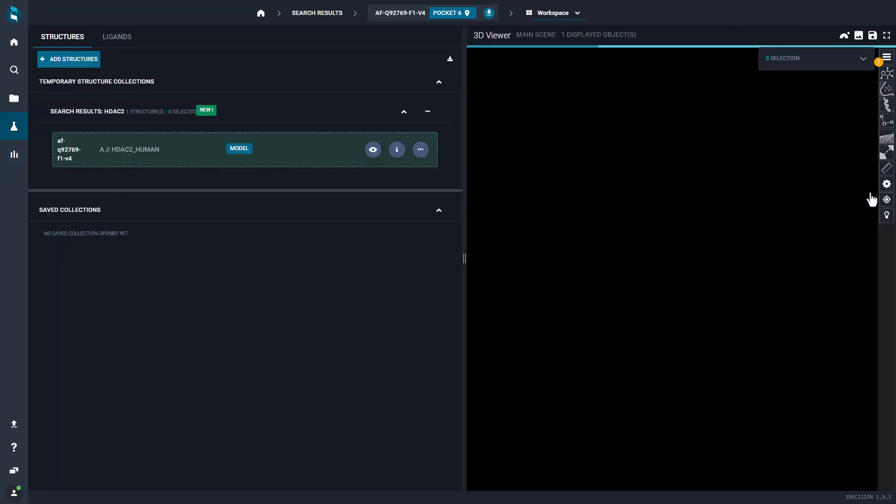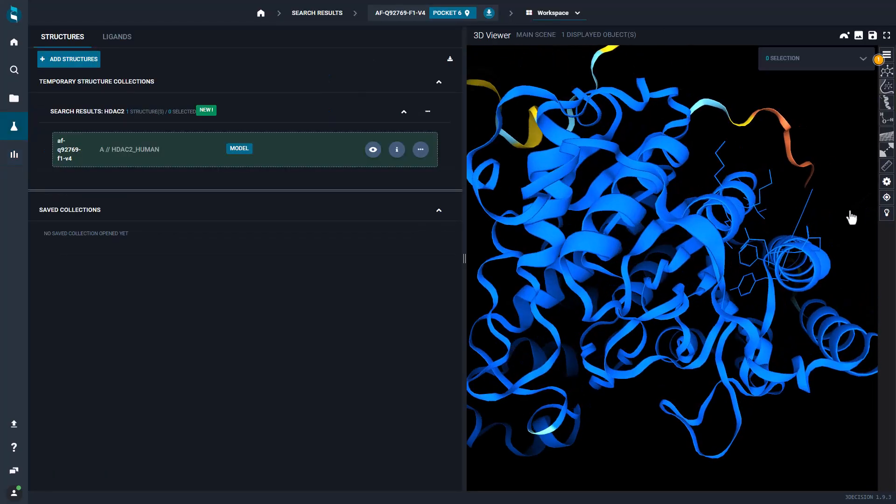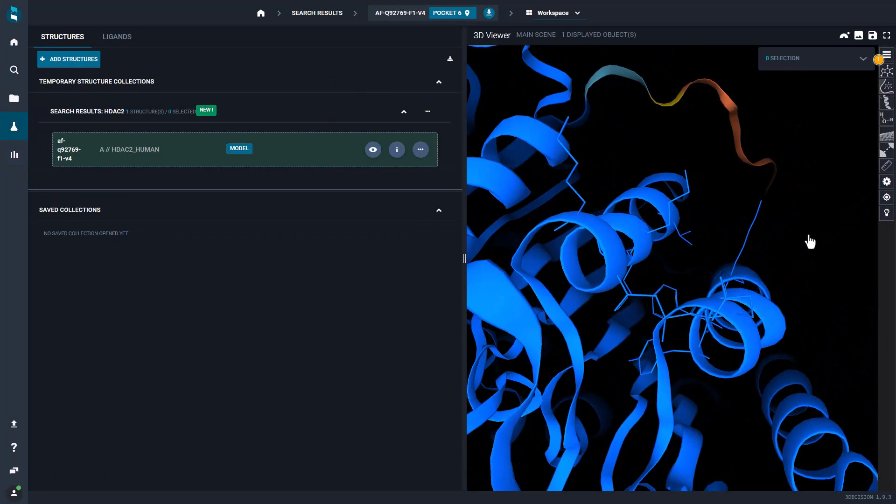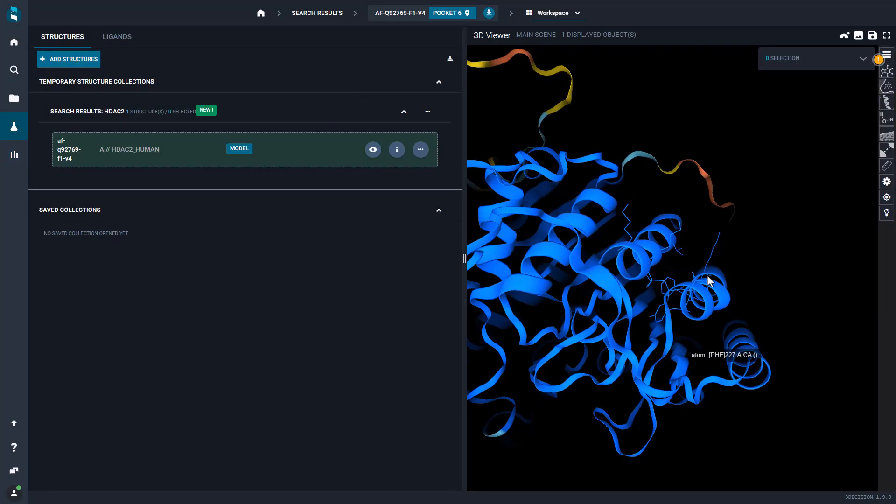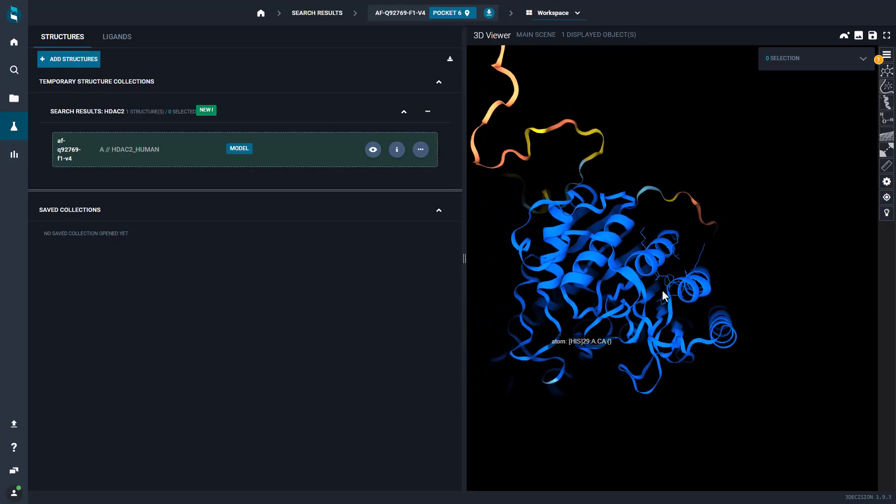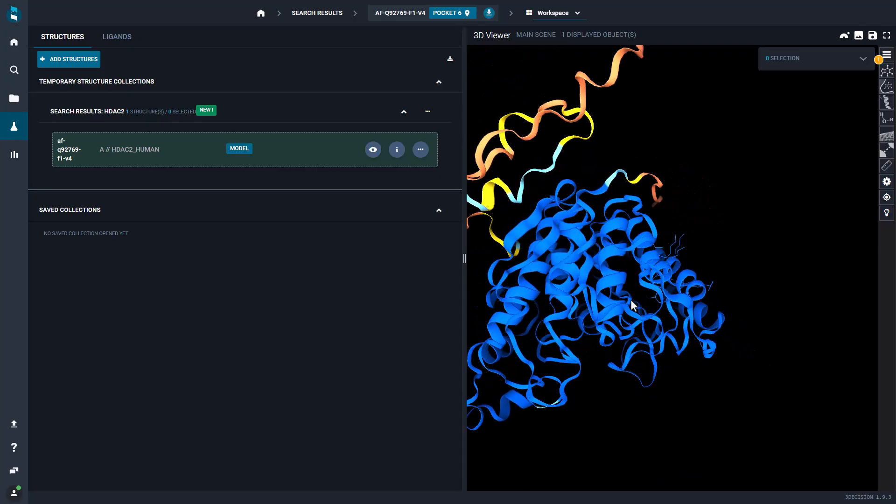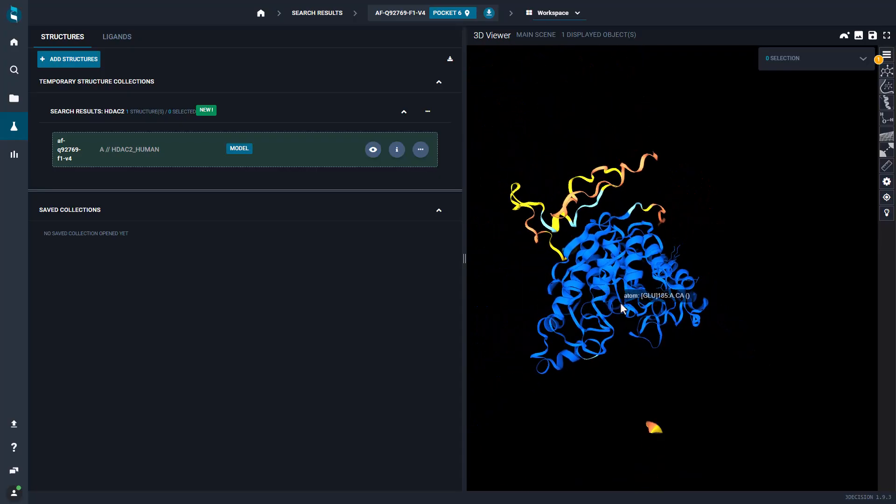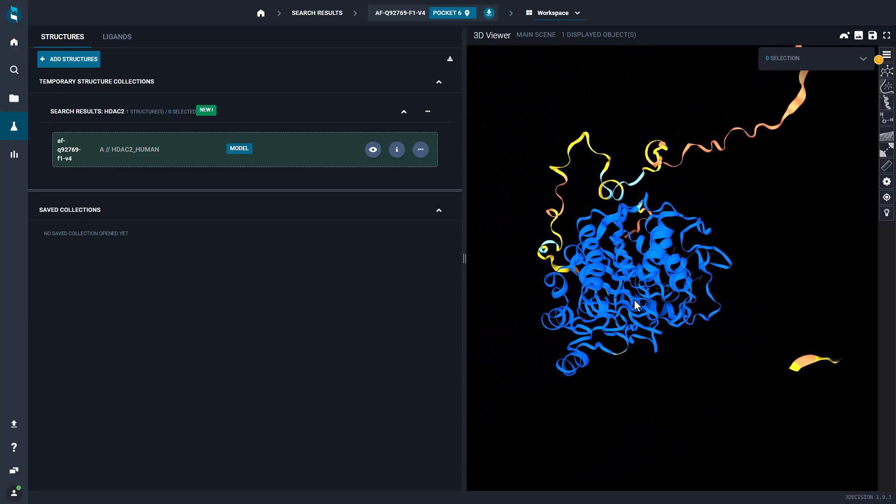By default, AlphaFold structures are color-coded using the PLDDT confidence score to immediately spot the parts of the model predicted with high or low confidence.